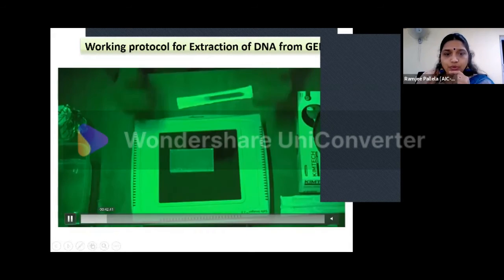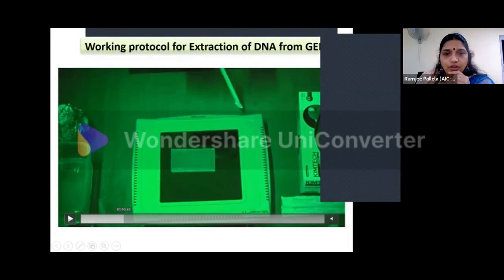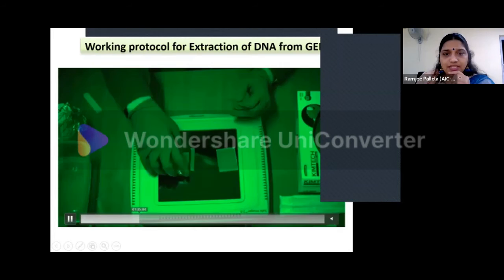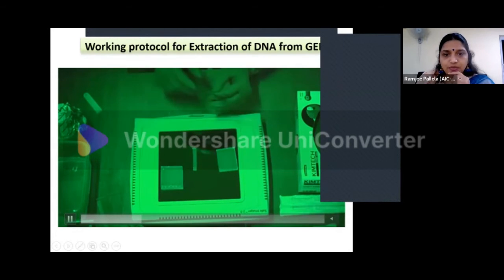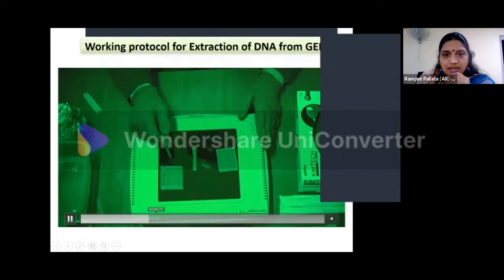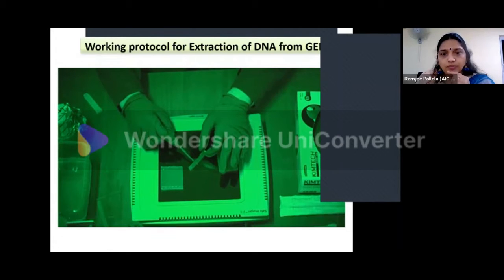Light in the sense that you know that there will be two wavelengths in a transilluminator. So when you put it on a transilluminator wavelength, you can see the bands here. Look at this. Can you see? And with these bands, we can start cutting with the scalpel. We cut it here. Slowly, you don't want to give any problem to your transilluminator as well.